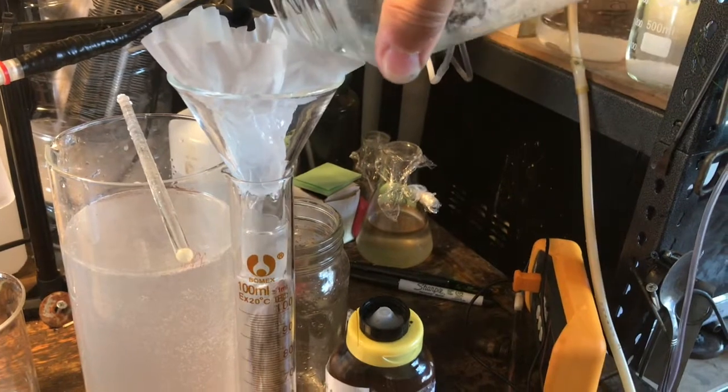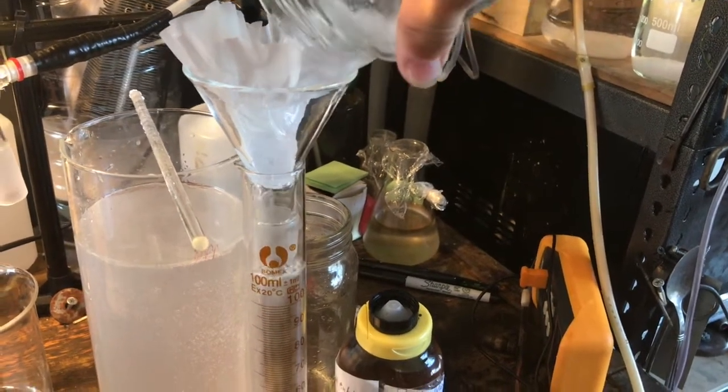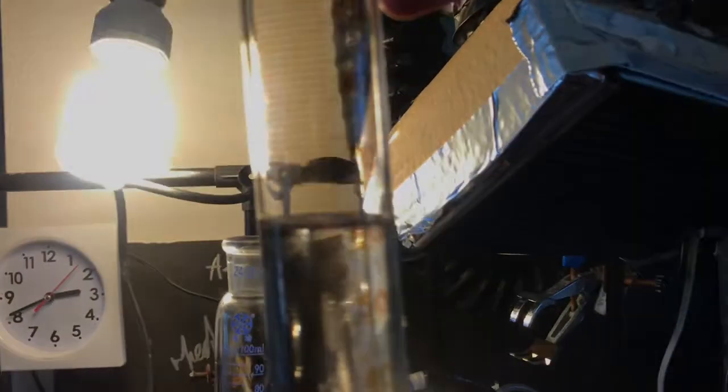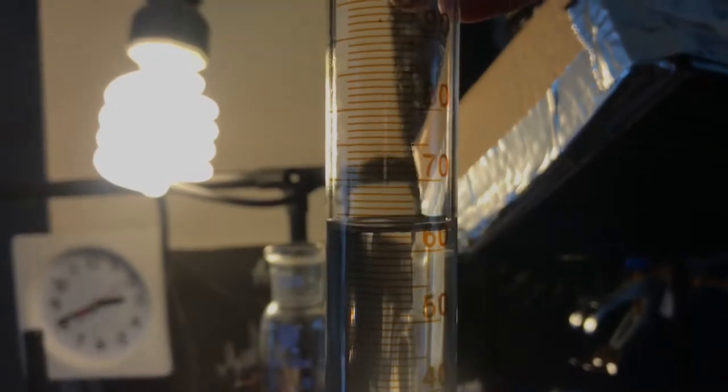After it's thoroughly dried, simply filter off the drying agent. You can see we have a decent recovery of about 64 milliliters. You can distill this if you want, however for my purposes I don't really have to — it's just solvent.